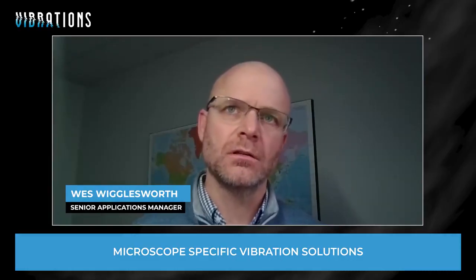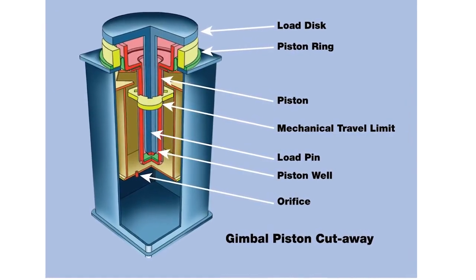Before answering that question, I want to talk a little bit about the differences of vibration isolation technologies. Pneumatic springs are a very good isolator, commonly used for things like laser tables, optical tables, kind of the foundation of any physics lab or even chemistry labs. And these pneumatic springs are excellent at filtering out vibration coming from the floor or from a frame, typically at high frequencies, say 10 hertz and above or 20 hertz and above. And they're self-leveling typically, not always. And essentially, again, it's a low-pass filter.